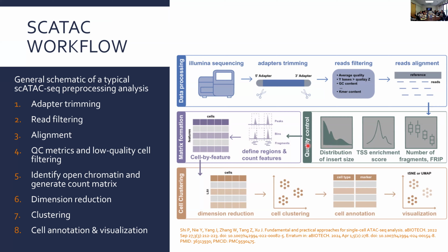Yes. And then here you're still ending up similar to single-cell. You want a matrix that is your samples, your regions. So now the rows instead of genes are regions of the genome. And instead of doing principal component analysis for dimensionality reduction, you tend to use LSI, which is latent semantic indexing. This is a method actually from natural language processing that's been adapted over to genomic data. But you still end up clustering cells.